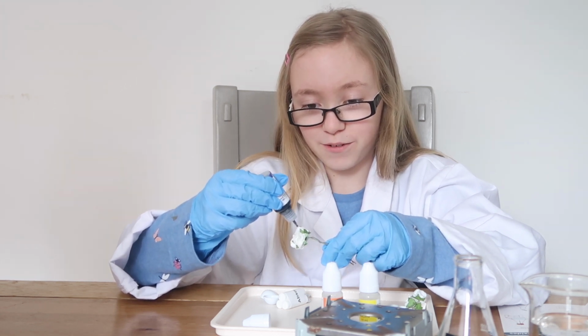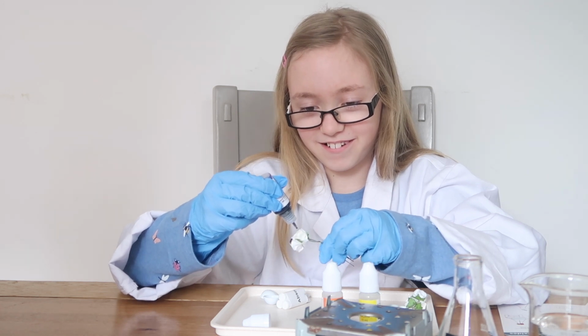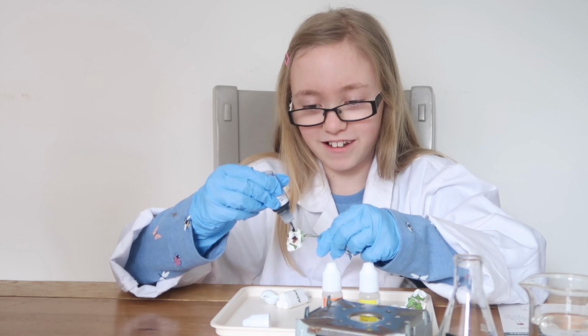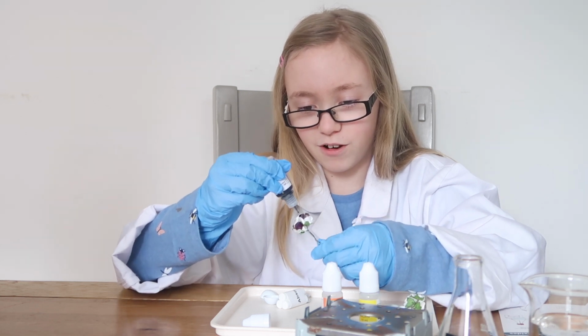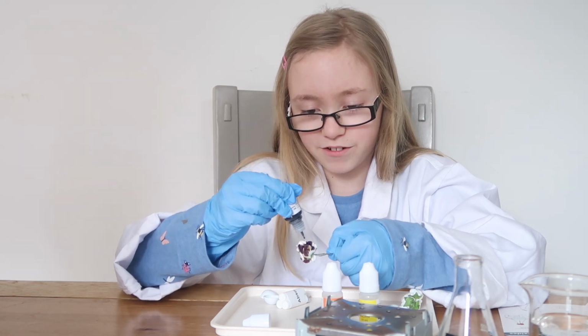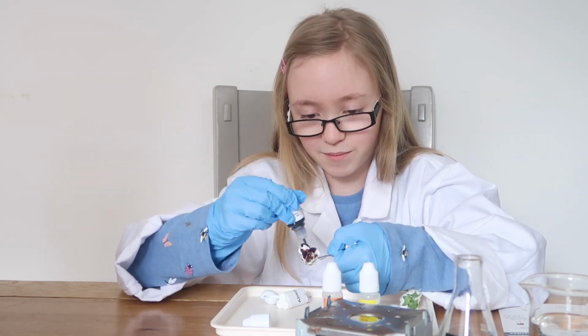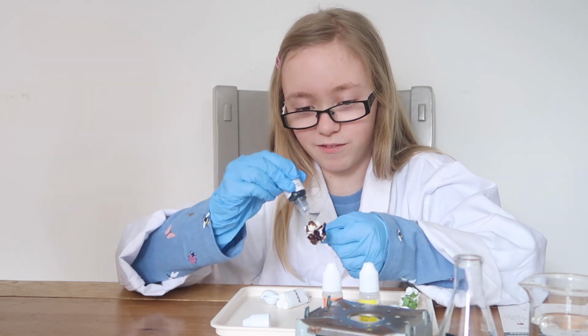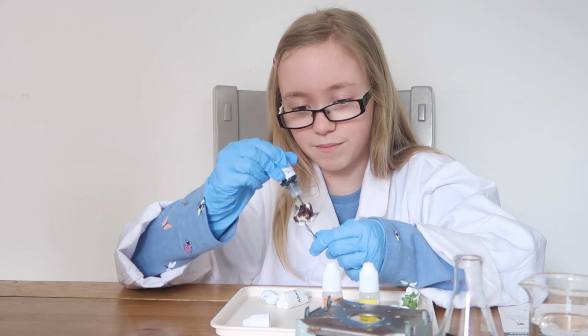Ooh, it's blue. Okay, so I'm being very careful, concentrating, and I'm going to drip this all over the flower to make sure it's blue. Oh, I can see a tiny bit of orange. That's weird. I was expecting it to be blue. Okay, it's on all of the petals now. Just need to do this a little bit.